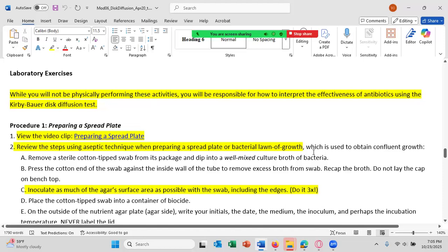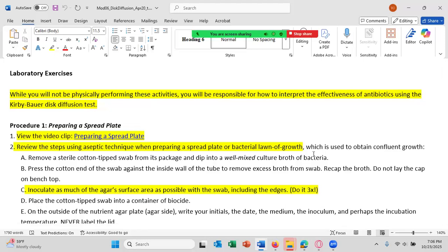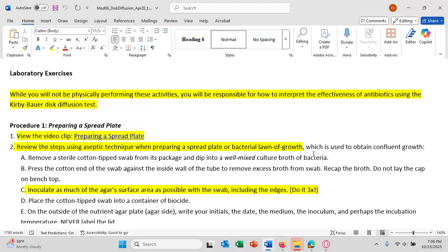That's the correct procedure. Actually, in the microbiology lab, we always did overnight because 16 to 18 hours would not be possible from class to class. Come to think of it, actually, overnight wouldn't be either because we did Tuesday, Thursday. What happened was someone would come in and pull the plates after a day and then put them in the incubator, in which case they may have done it 16 to 18 hours.